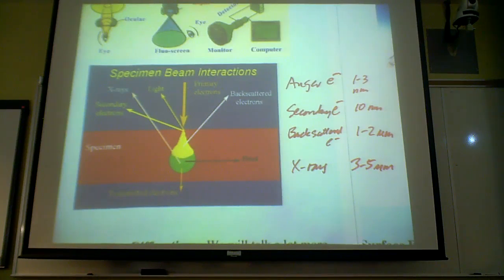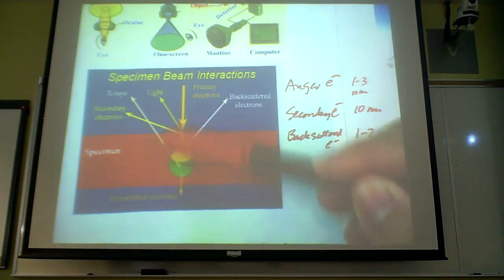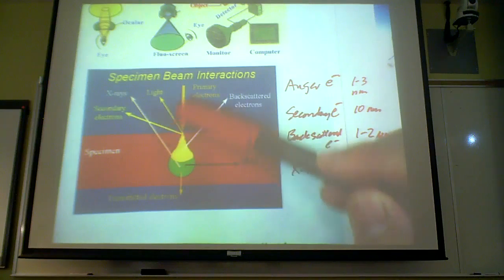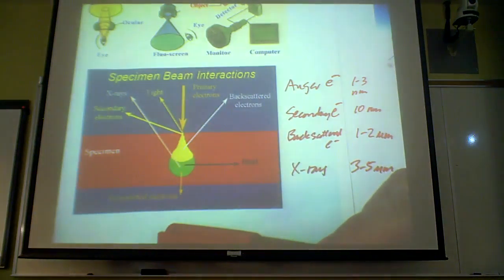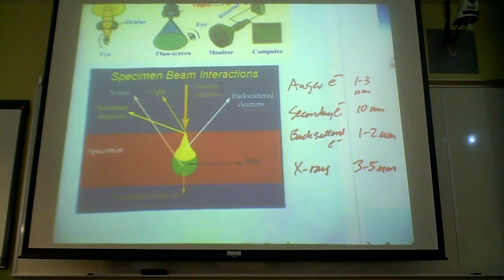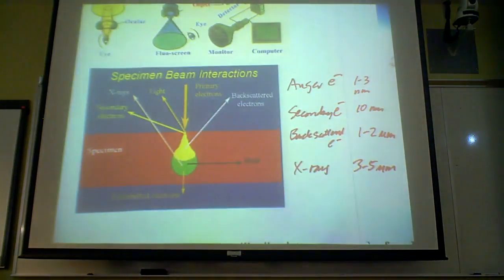You are not really seeing surfaces, right? Because you're actually seeing a column of material. The electron is interacting with a column of material that you see, right? You're not really looking at the top layer, because the electron beam has to penetrate through the entire freestanding film. So be careful when people are talking about TEM. Even though you see beautiful single atoms, you see a lot of these little pictures, you're really looking at a column of atoms that you see on this film.